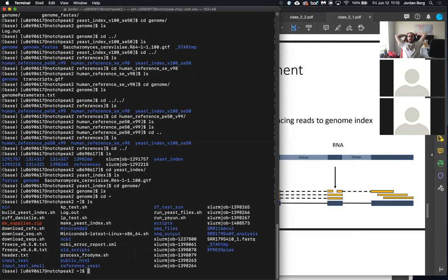Okay. And then for the second part, fastq-dump, instead of giving the input directory address as the NCBI folder, I had to specify it up to my home directory, so that it can pick all those files from there.